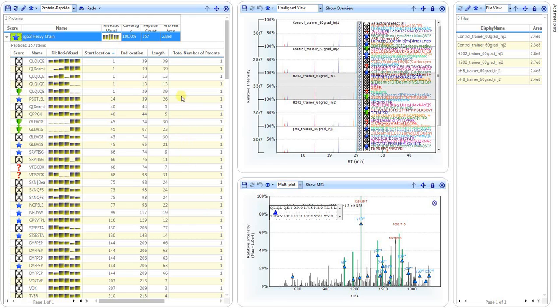to them in either the results table, which is here to the left, the chromatographic view shown here in the middle, the top of the center, or the mass spectrum as I have it laid out in my particular workbook. And all of these windows can be movable.